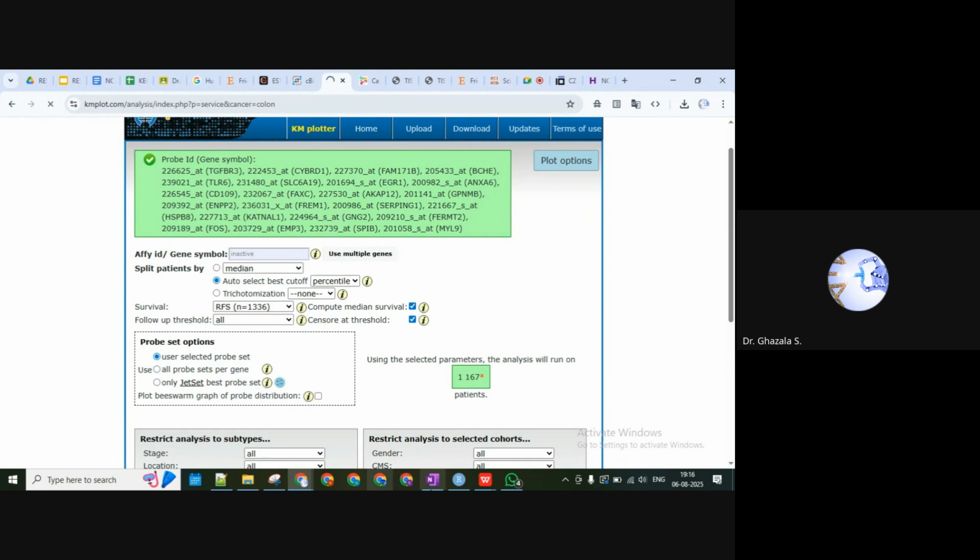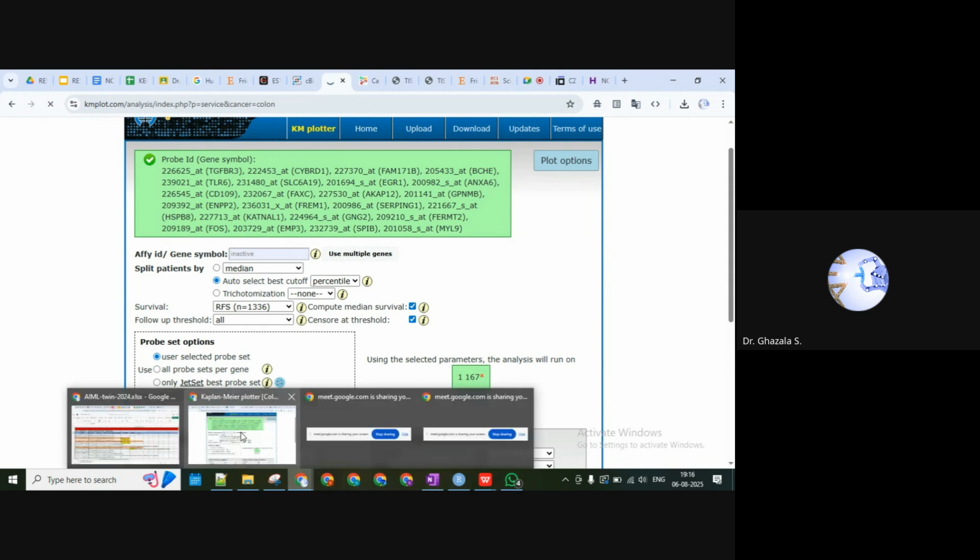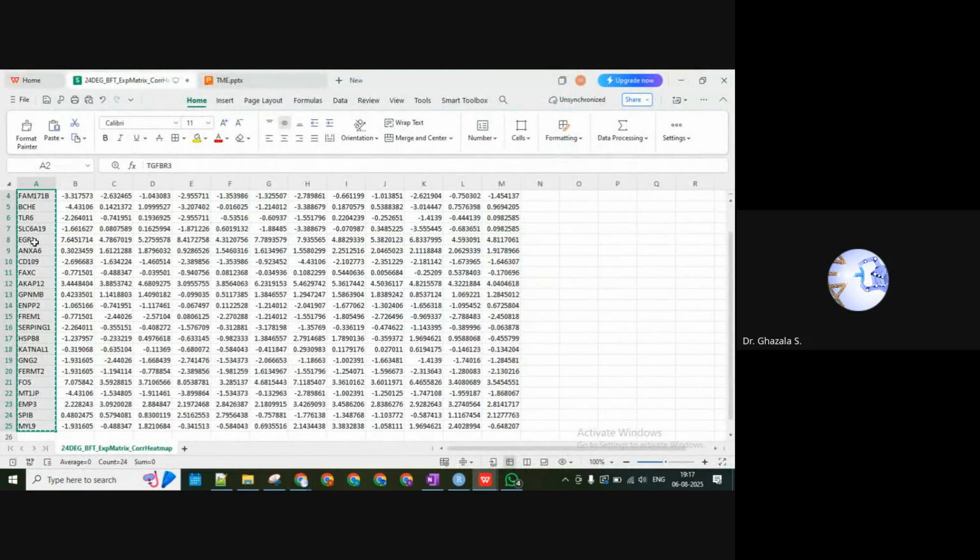Okay. And yeah, network analysis we already performed. So now, since you know which are the novel genes for which you don't have any information related to colorectal cancer, and the other genes for which we have information, with that perspective what we can do is again perform the network analysis, and then see how these genes are interacting with each other.